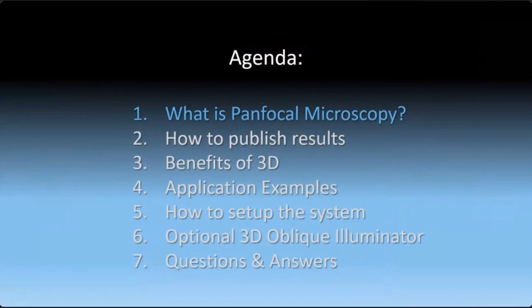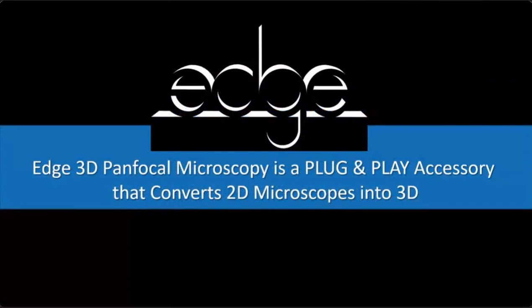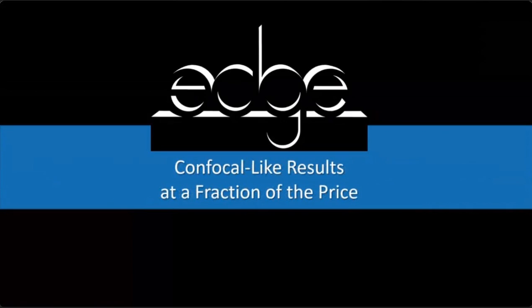So the agenda for today is I want to tell you what panfocal microscopy is. And then we'll talk about how to publish the results, what the benefits are, some application examples, how to set it up, and the optional 3D oblique illuminator, and then we'll take some questions. So the Edge 3D panfocal microscopy is a plug-and-play, simple accessory that converts your 2D microscope into 3D.